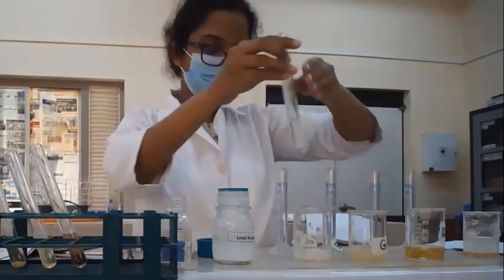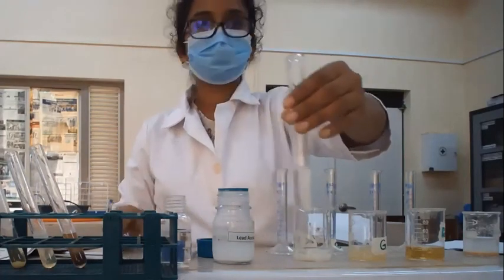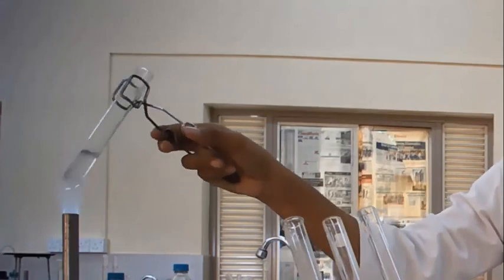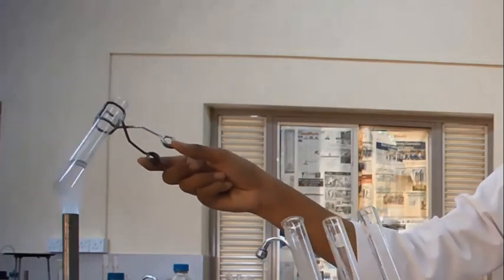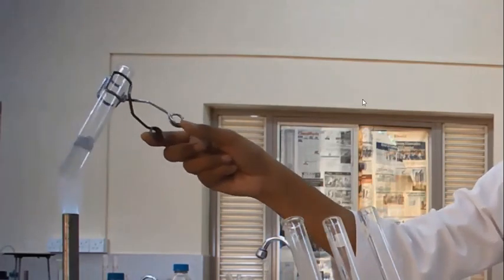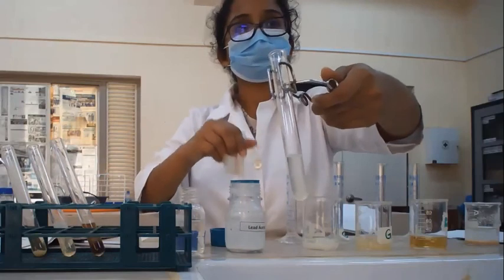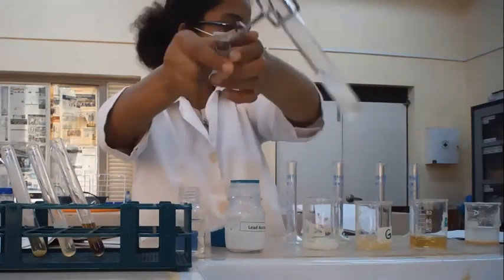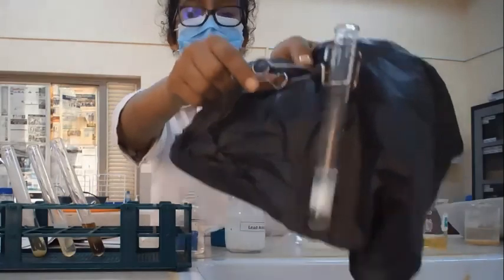Then I'm moving to the casein sample. Here also we are going to add a few drops of sodium hydroxide, and then I'm going to heat it in the Bunsen burner. After boiling this, I'm going to add lead acetate into the sample. You may observe a white color precipitation in casein also.